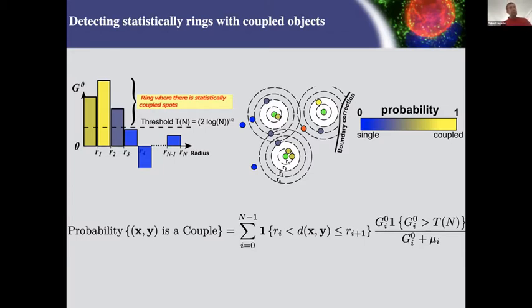Then I can compute the probability that this specific object is here by chance or not. Typically in an analysis, if you expect one object by chance and you have 100, it means you have a probability of 99% that each object is here through the coupling.